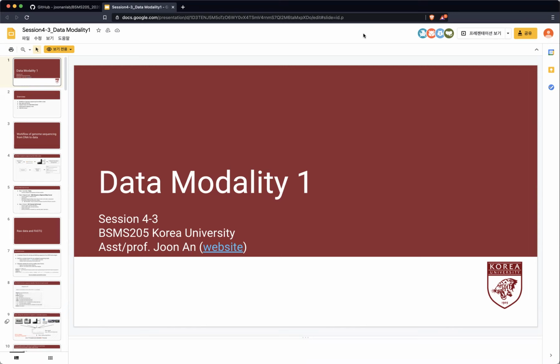So you have to make the connection between the sequencing information, the DNA information, and the data file format. I would say this is probably a very unique time to learn about the latest sequencing data set, and you may find it quite awkward, because you never learned about data formats in your previous learning. If you have any questions, you are always encouraged to leave them on the Slack channel.